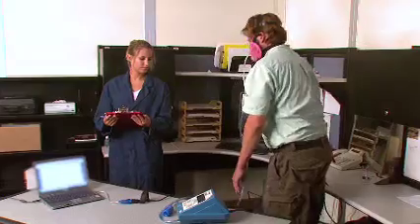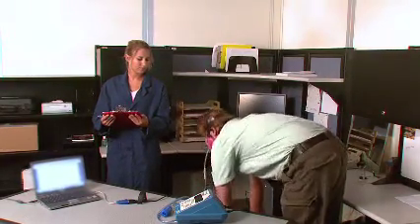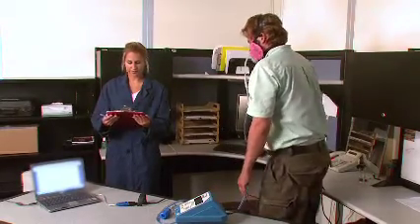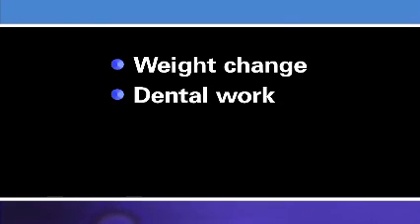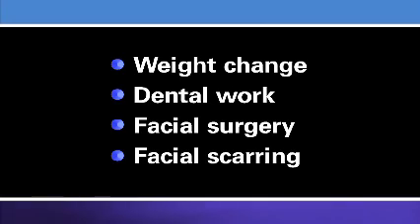Also, the fit of your respirator must be retested whenever you have a change in your physical condition that could affect the fit of your respirator. Such changes could include large weight gain or loss, major dental work, such as new dentures, facial surgery that may have changed the shape of your face, or significant scarring in the area of the seal. Any of these changes could affect the ability of your respirator to properly seal to your face, which could allow contaminated air to leak into your respirator facepiece.